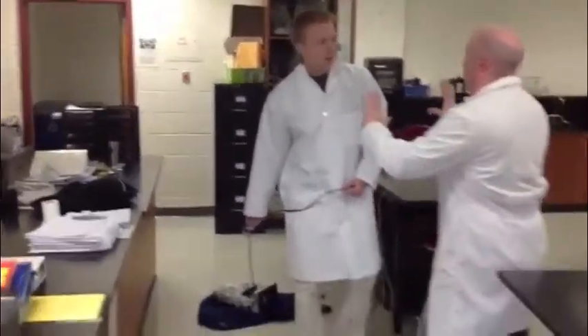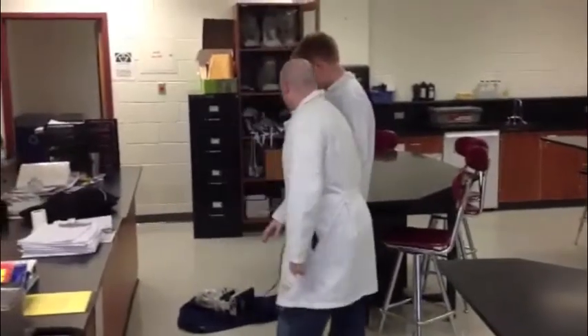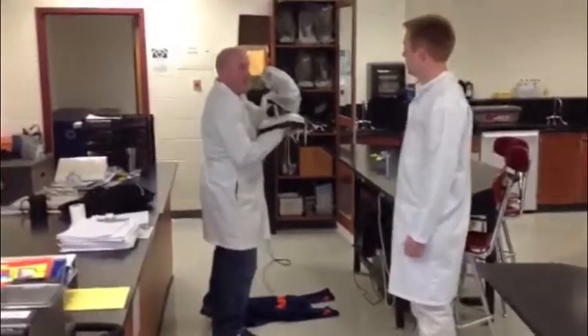Mr. Weber, am I carrying this right? Whoa, whoa, whoa, Mr. Stewart. You should always, always, always put that down. You should always carry the microscope with one hand on its arm and one hand on its base.